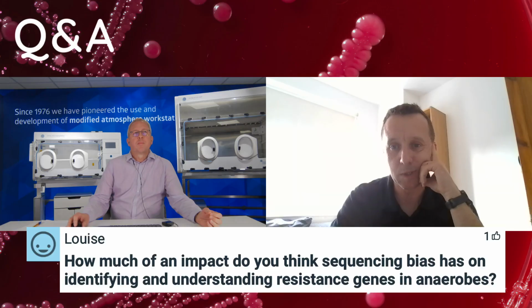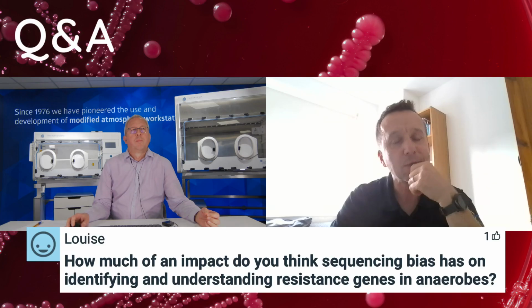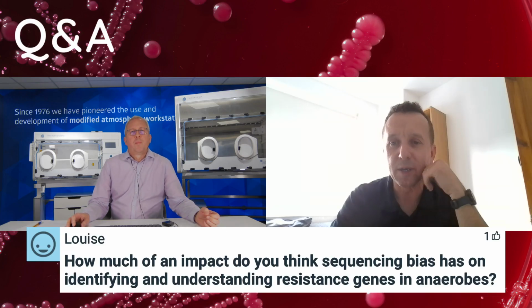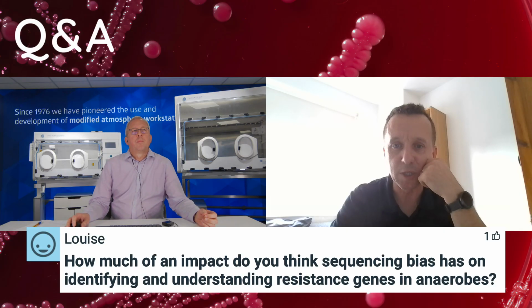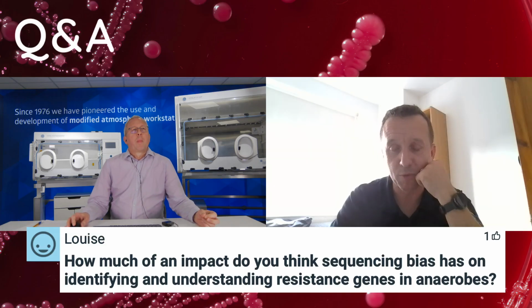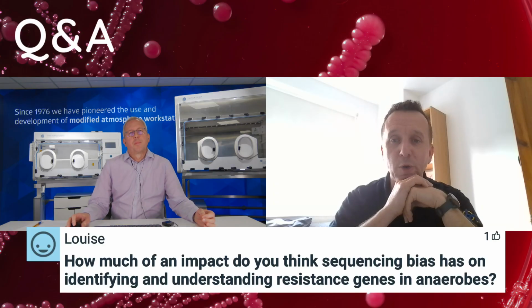We only use one sequencing platform, and we're not able to really drill down into that at the moment. I don't think it's in enough common use to be able to really answer that question fully yet. But again, it's happening more and more, and it's something that we're learning more and more about.